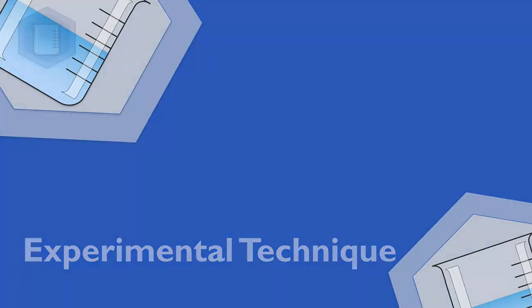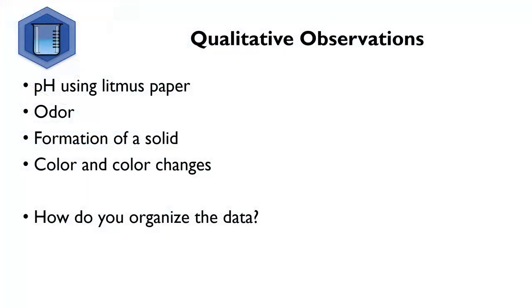Experimental techniques. Success in lab this week will be based on your powers of observation and ability to collect useful qualitative data, specifically determining pH using litmus paper, changes in odor or smell, the formation of a solid, and color changes. We also need to address how you will organize your data a bit.